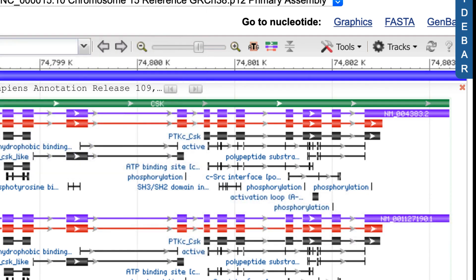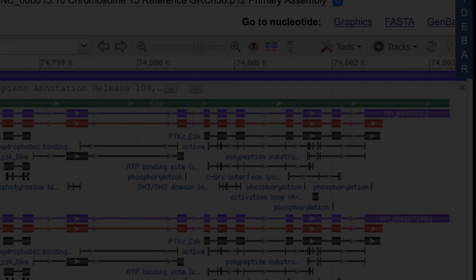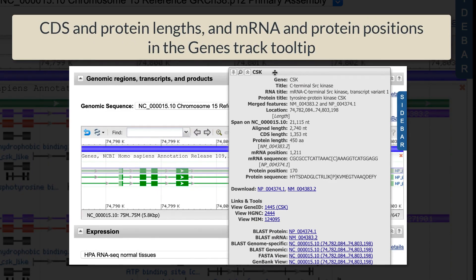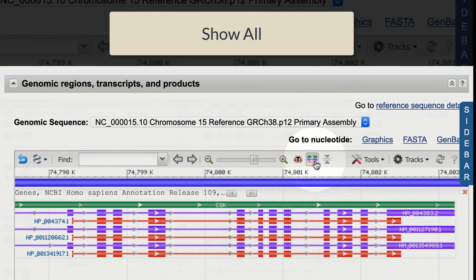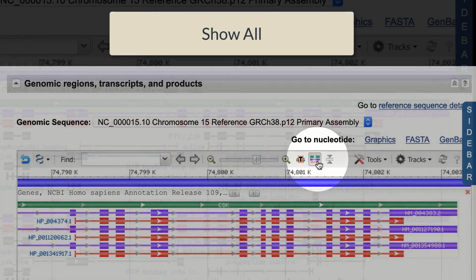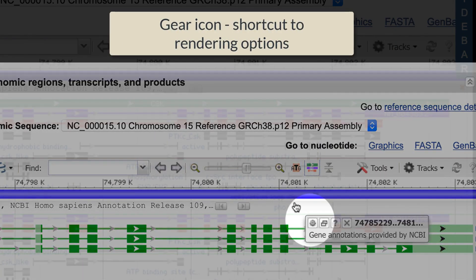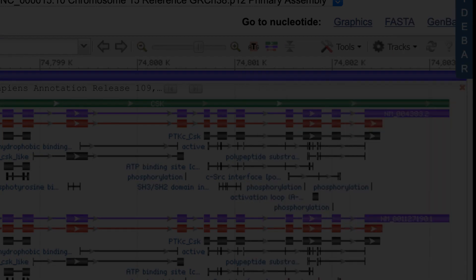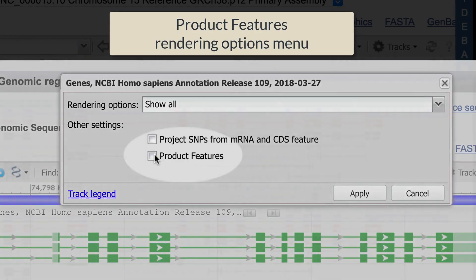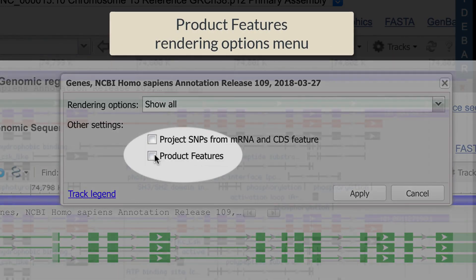That's it for now. Here is a summary of the settings I just covered: the addition of CDS and protein lengths in the tooltips, the show all shortcut, the shortcut to track rendering options via the gear icon in the track tooltip, and product features in the rendering options menu.